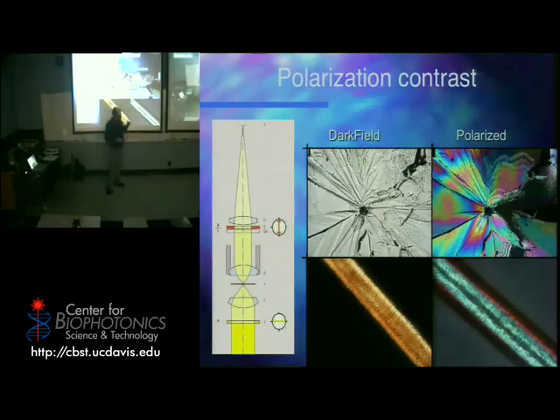This is polarized microscopy because what it does is it says, by having these filters in there that polarize the light, in theory, nothing should be coming through. I've got them crossed to each other. There should be no light coming through. But the reason I see some is because the biological material that I have in the path is birefringent, which means it turns light. Traditionally, materials that turn light are materials that are very highly structured. Hair is very highly structured, and it's birefringent. It bends light. So it allows you to do this. Sugar crystals do the same thing. Salt crystals don't. So some things are birefringent, some things are not.